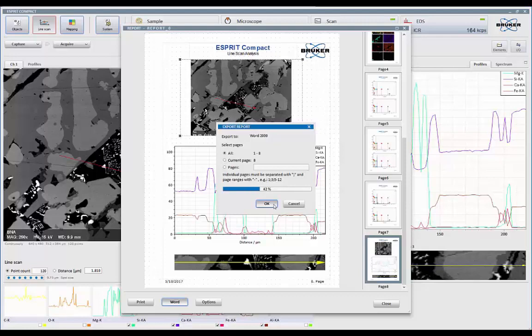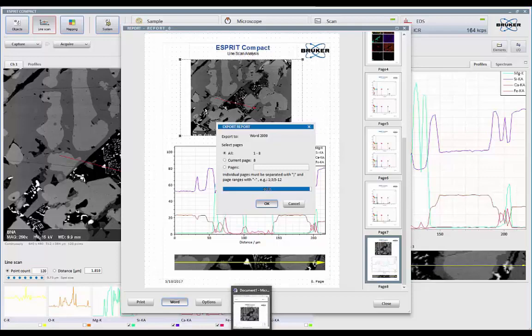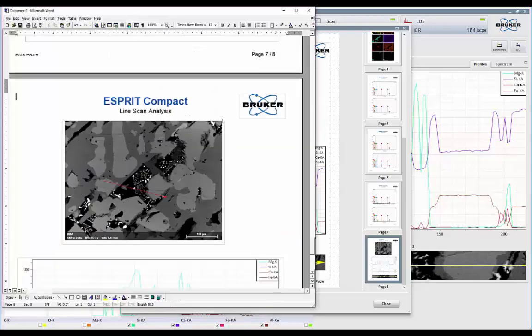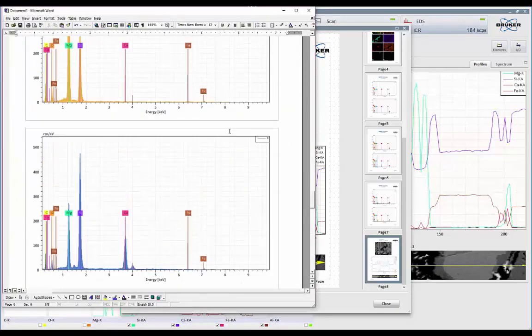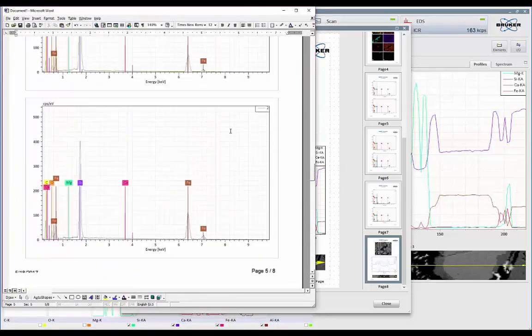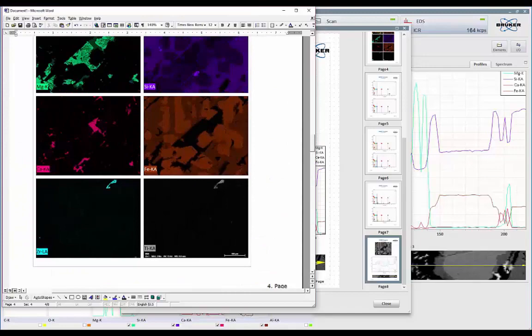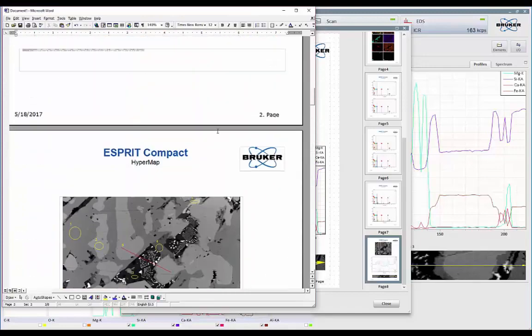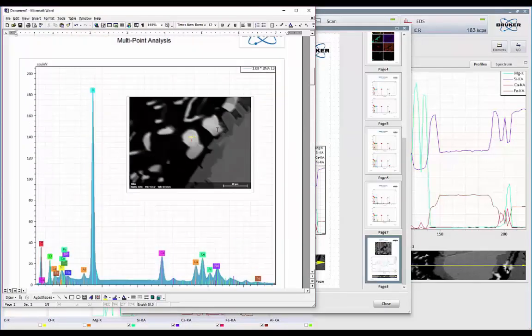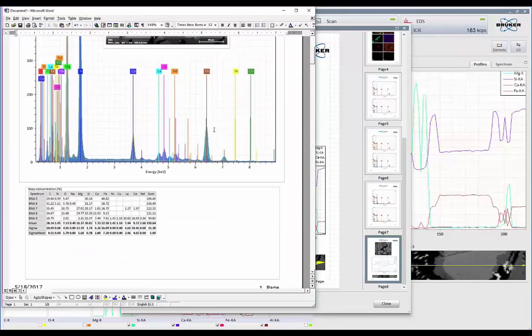Now, obviously, you need to have Word to do this. So there's my Word document showing all my data that I've transferred over.